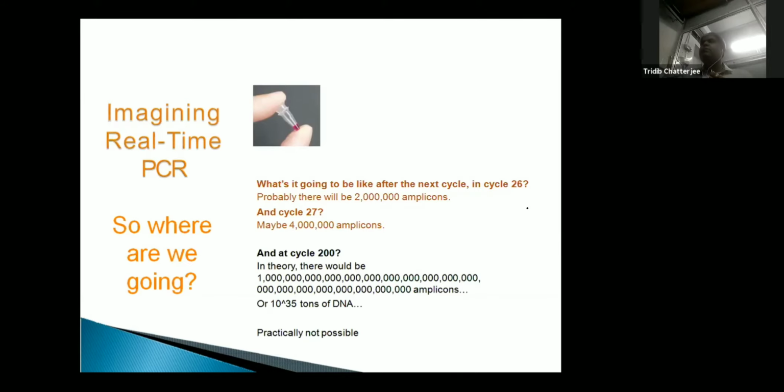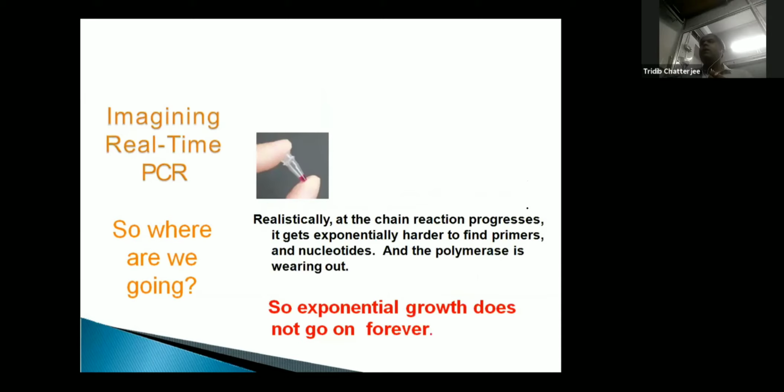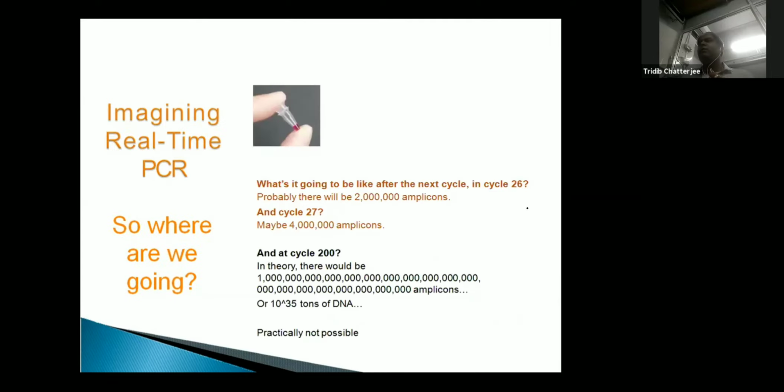And number two reason is probability, because you can understand, when the number of copies of DNA present is very high, the probability of finding the primer to the template will be very less. Once it is very less, then the amplification reaches a plateau.